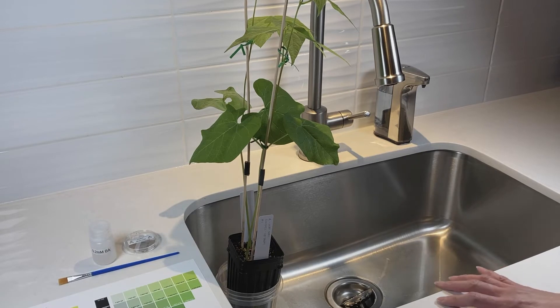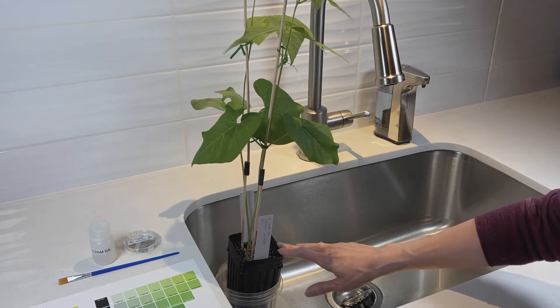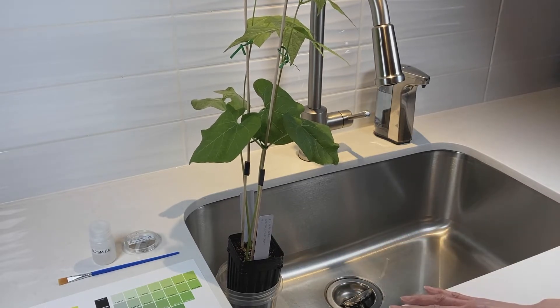Hi everyone. I'm going to demonstrate the leaf senescence experiment. There are two parts to this experiment: the one that uses the bean plants, as you can see here, and the one that uses the wheat seedlings. I'm going to start with the bean plant.